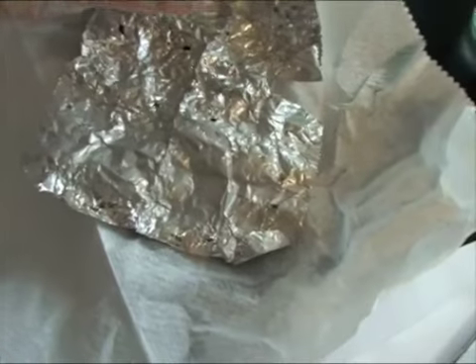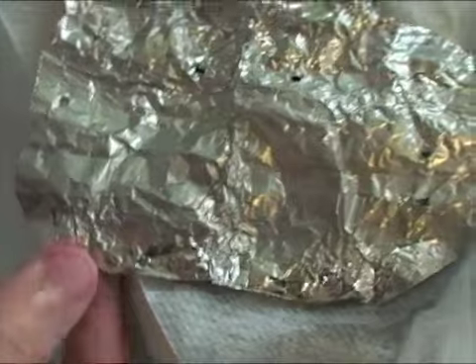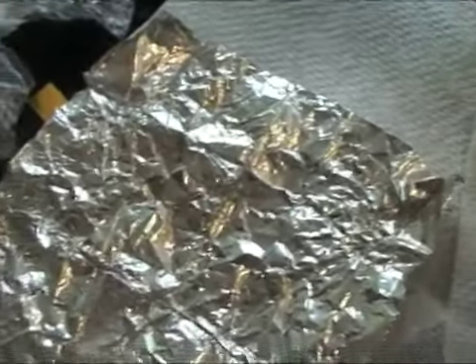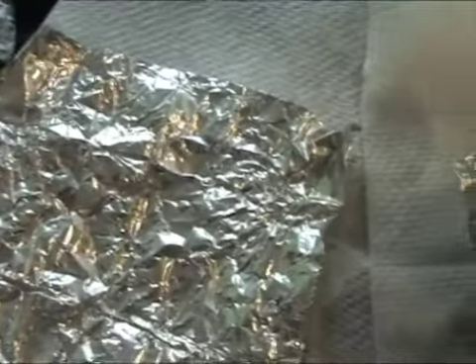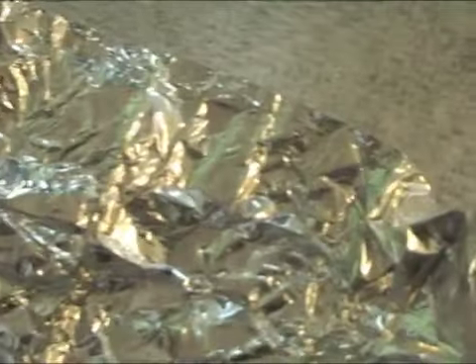Here's the aluminium foil that was placed in the sulfuric acid. As you can see right there, that was the part that was touching the acid. It's a lot less lustrous than the other side that was not in the acid. Here is the aluminium that was placed in water. It reflects light on all sides in every direction, showing that the water did not have any effect, while the sulfuric acid did.